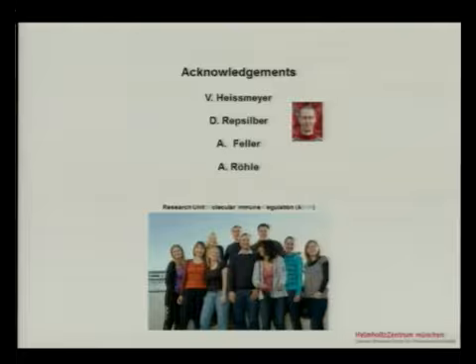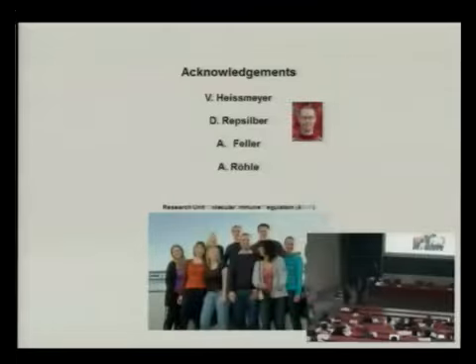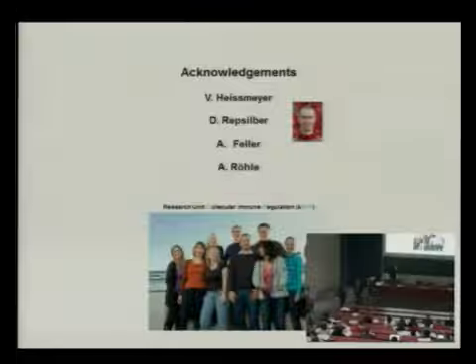You said that you get about 1.5 cycle shift between your FFPE and cryo. So this is more or less a 3-fold expression difference. Right. And you also showed that some genes are only present, especially the low copy genes, if you have 50 or 100 cells. Yes. But for the low copy genes, this 3-fold expression difference might be the essential difference to detect them, or? That is true, but the effect of microRNAs in general on translation is just a very tiny bit.